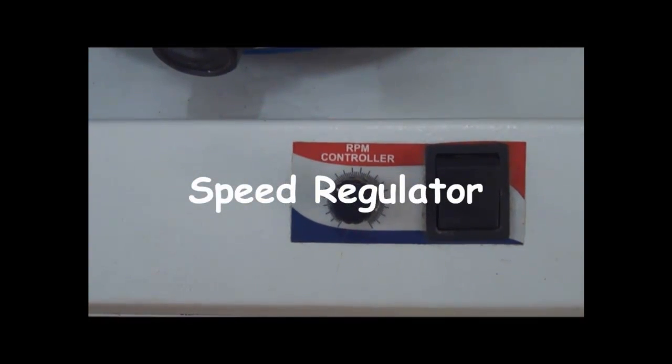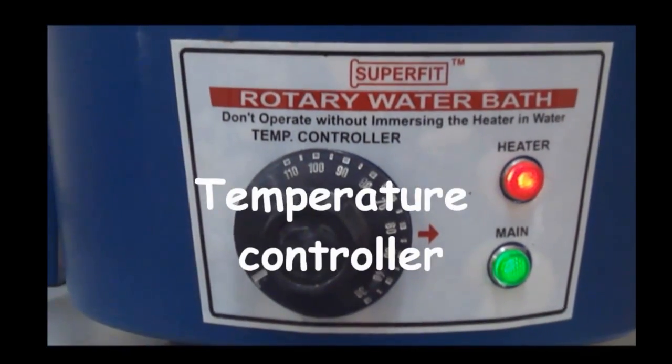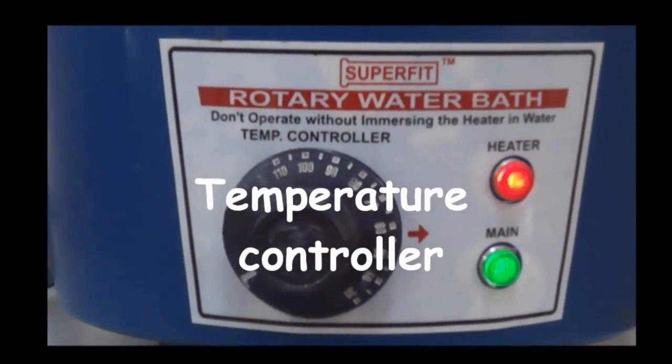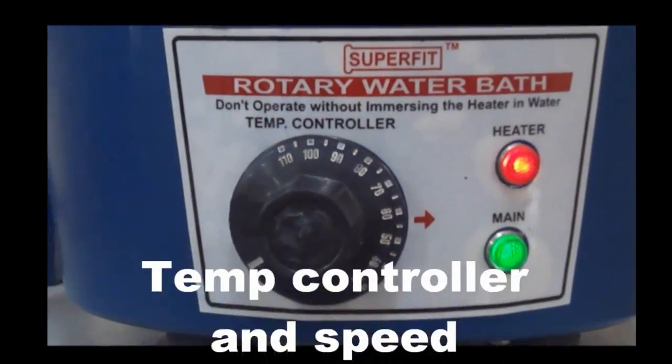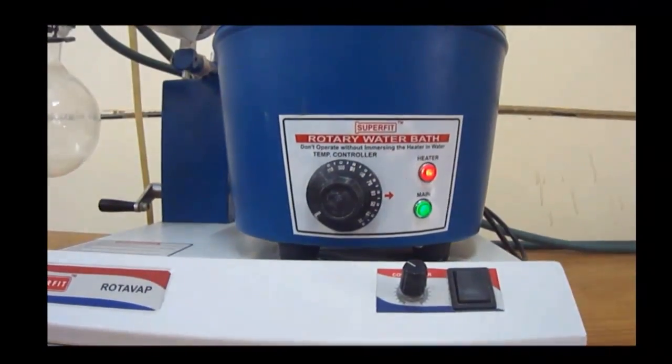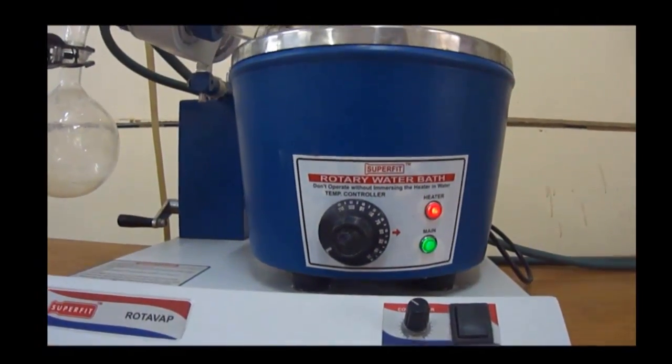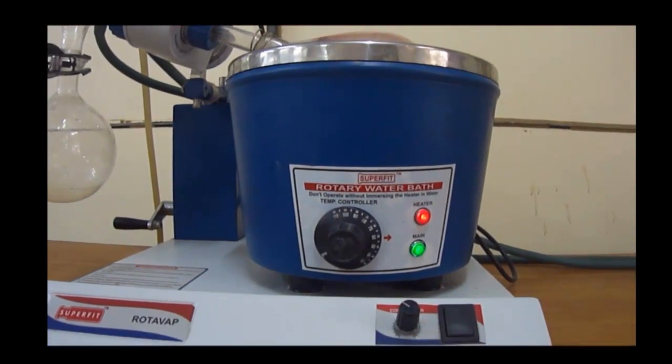The RPM controller switch acts as a speed regulator. The temperature controller knob is used to adjust the temperature of the water bath. Both temperature controller and speed regulator are present in the control panel which acts as a platform for the water bath.